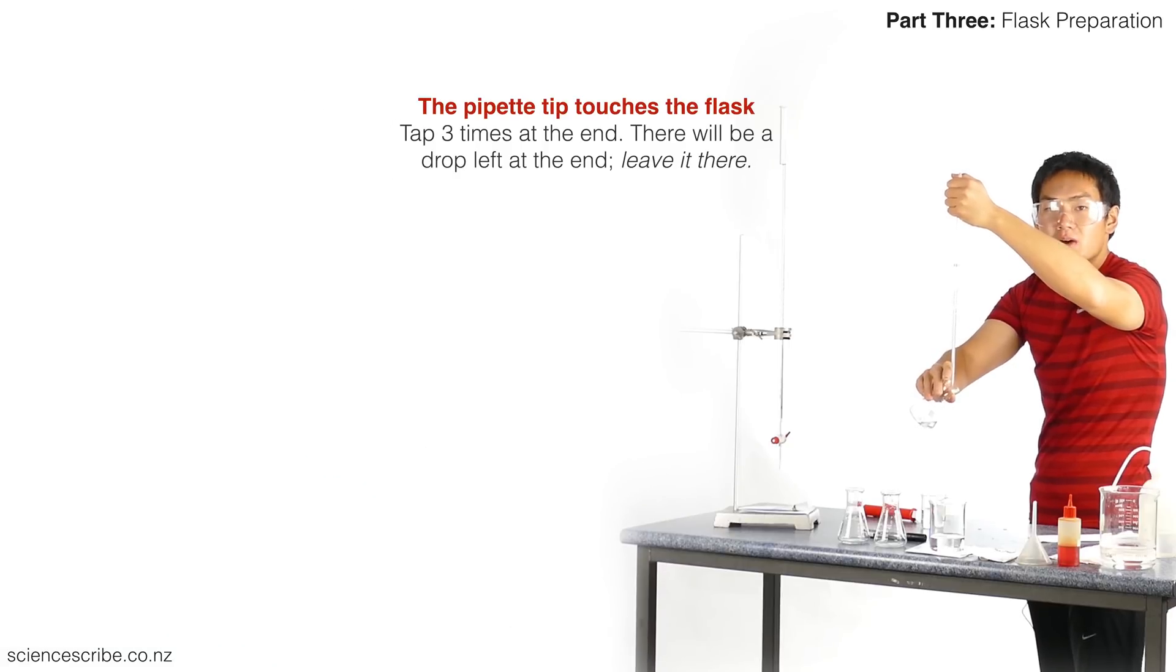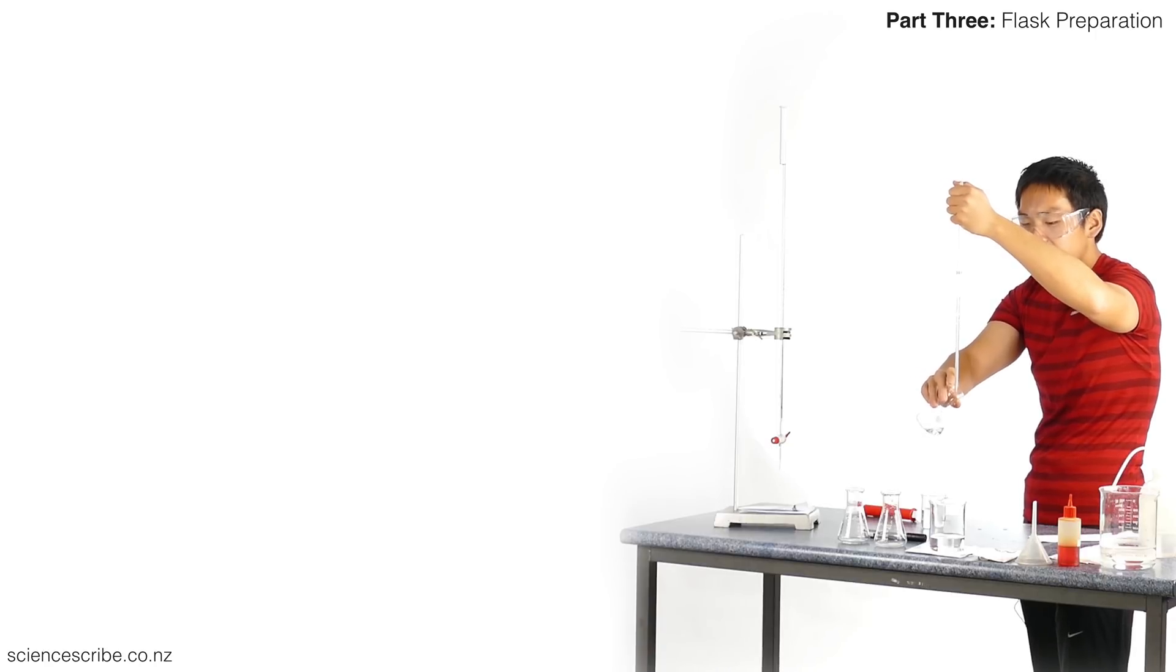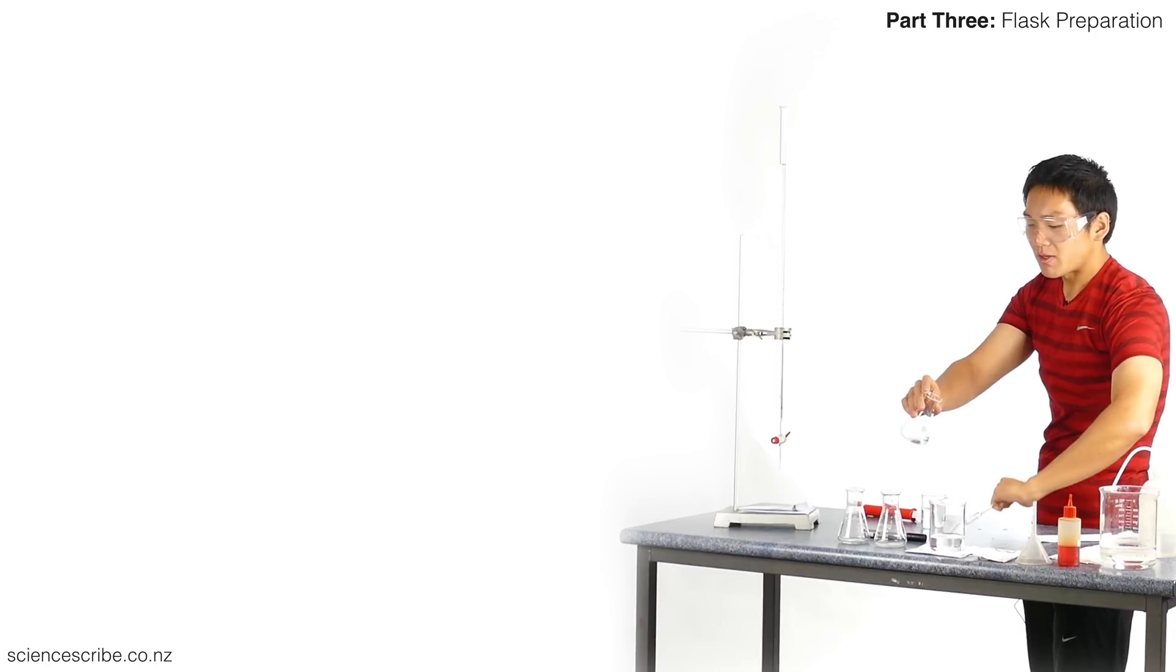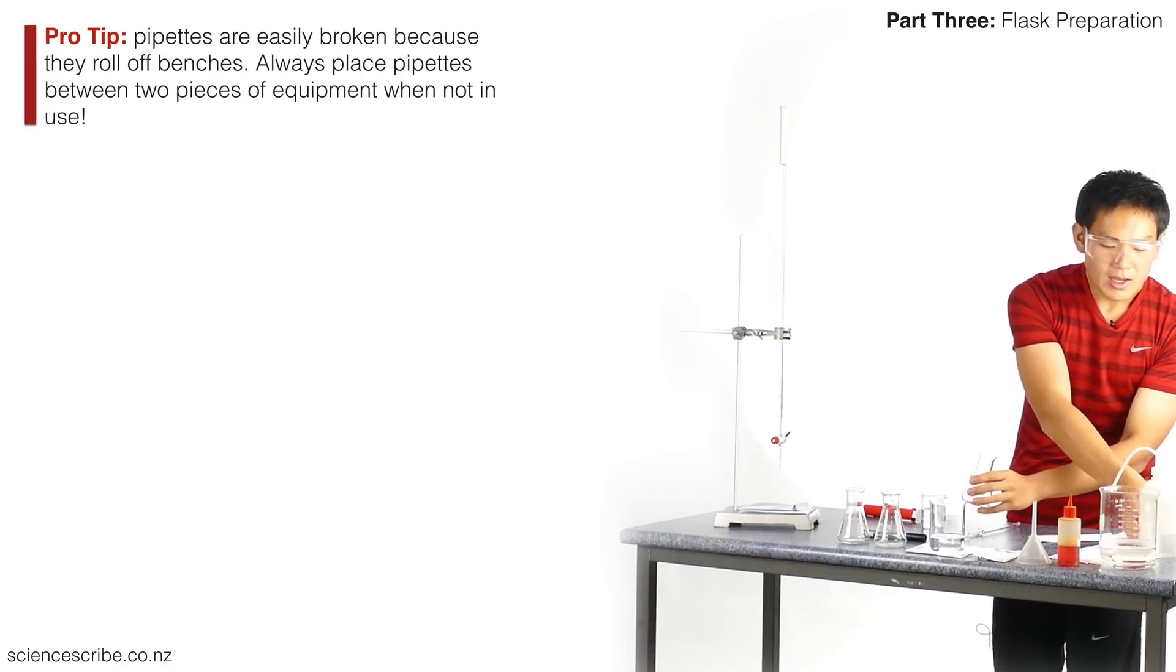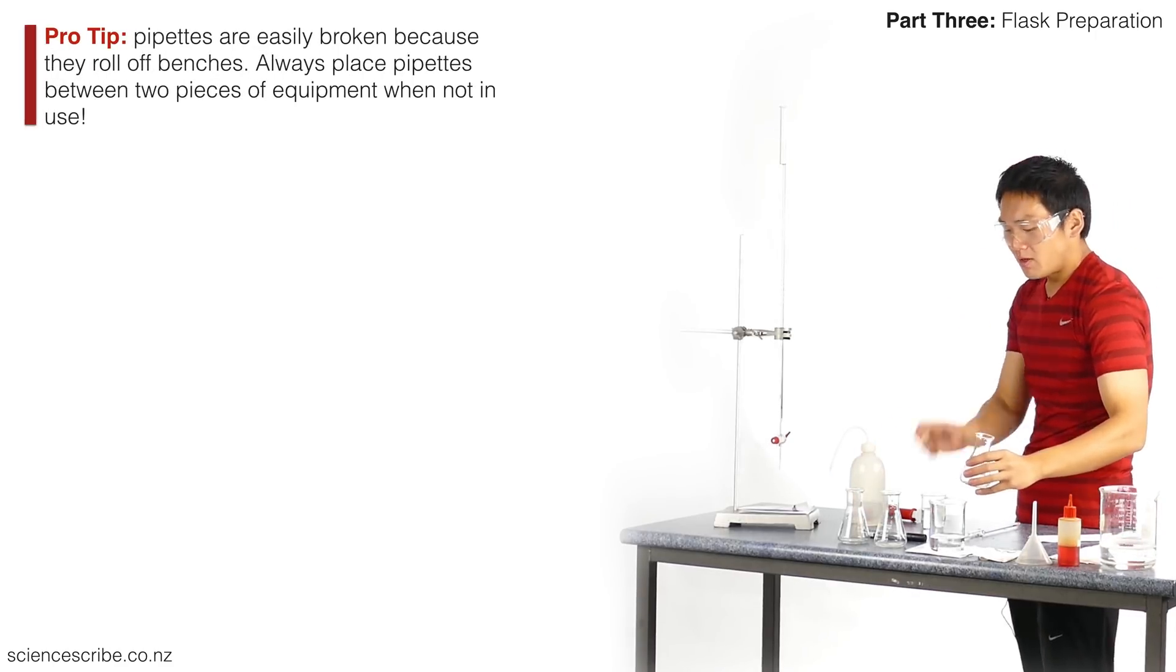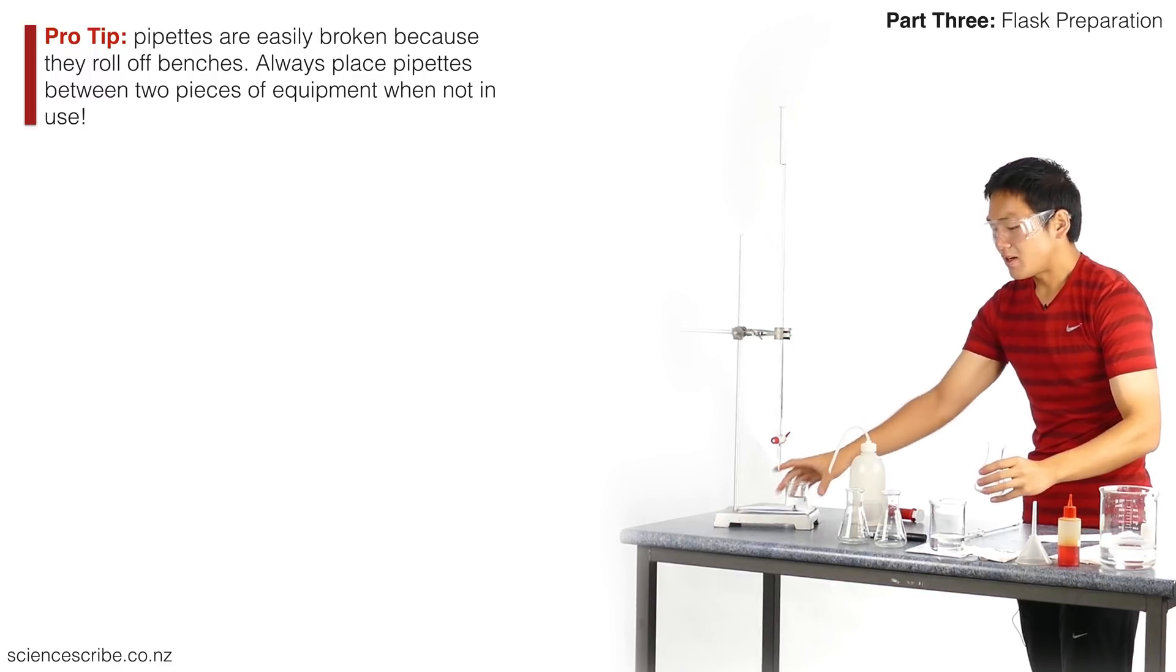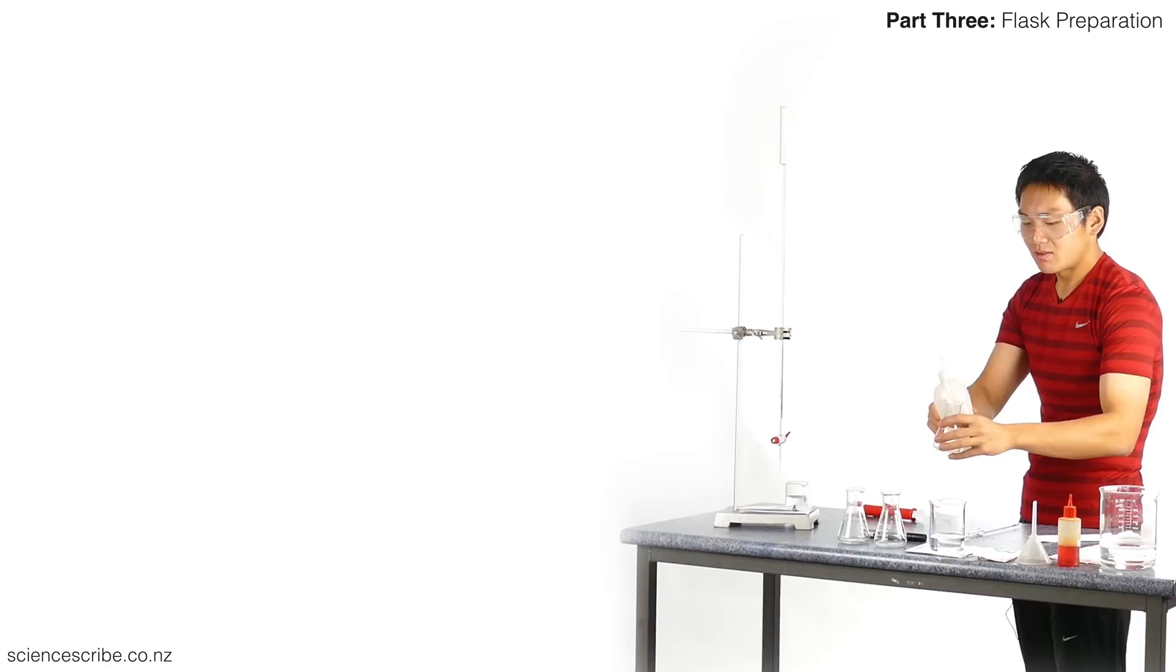That's done. I'm going to sit my pipette down, but remember what I said about pipettes—be careful where you place them. Place them between two pieces of equipment. There's still some liquid on the side of my conical flask. We are going to wash that down using a wash bottle. If you want to be safe, move your solutions off to the side so you don't get any risks of spills and contamination. Just wash that drop down.